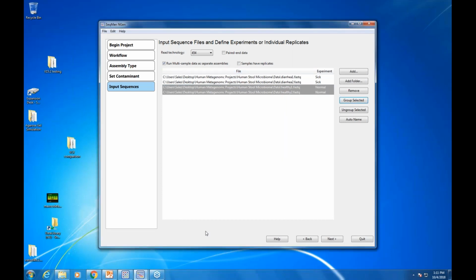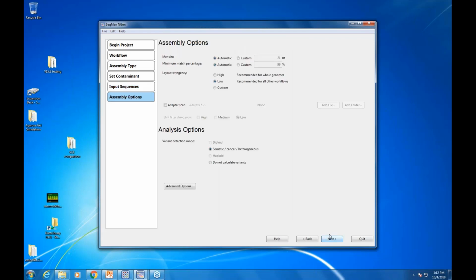All right, and I could have whole sets. There's ways to set replicates up. I could make replicates, and then with those replicates, group them together. So this is where we set up our experiment in terms of which FASTQ files go together. Sometimes you'll have multiple FASTQ files per experiment, sometimes it's one per experiment, so it gives us flexibility for setting the project up.